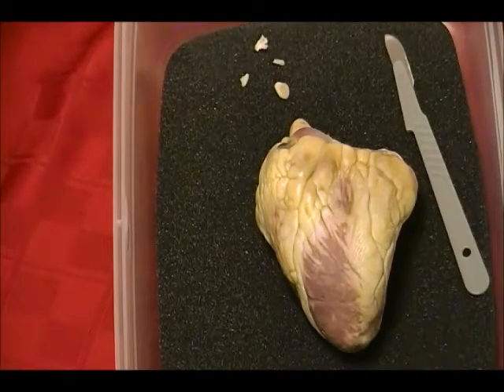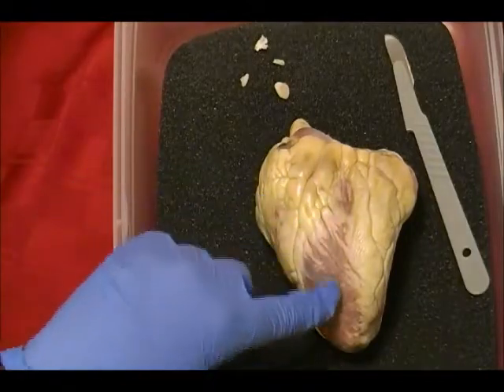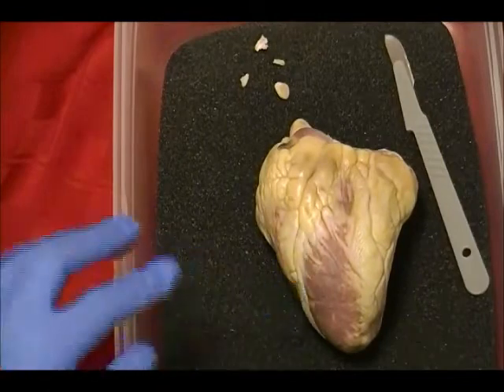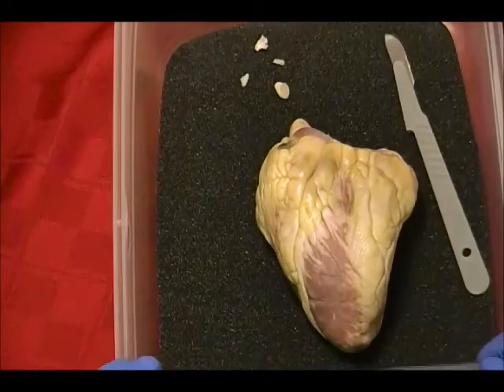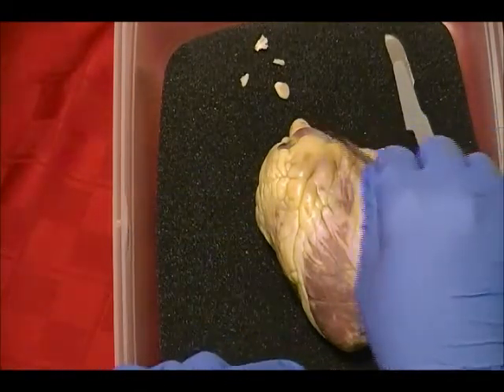Okay, starting with the exterior anatomy of the heart, we have the visceral epicardium, or visceral pericardium, which is also called the epicardium, which is the top layer of the heart. It's the top protective layer of the heart vessel. And then we've got the apex, which is down here, and the base, which is up here where the vessels are.